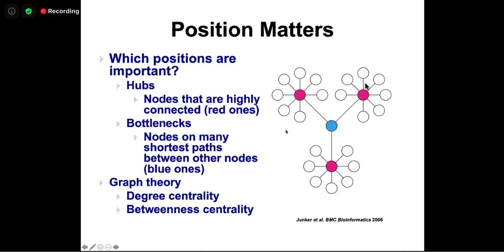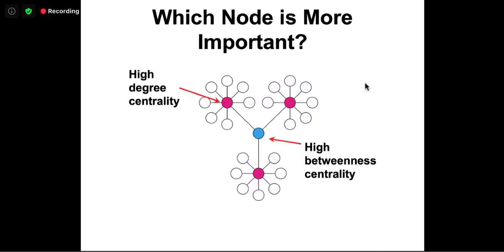This one is slightly more advanced, to help you select the nodes that are more important. What it says is, for the metabolites that are changed, if they are in a more significant or important position, they are more likely to have an impact on the pathway than those at the very downstream, at the lowest level. Because of direction, if you change here, you don't have impact on the upstream. So we use this intuitive reasoning. We just incorporated this one.